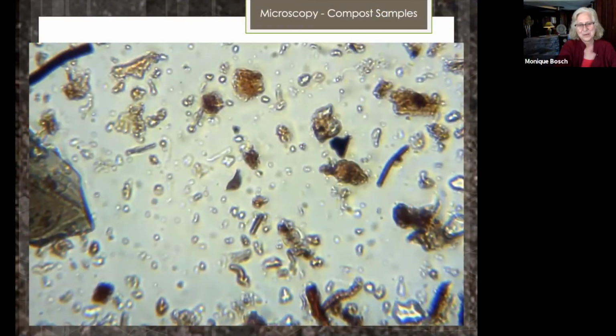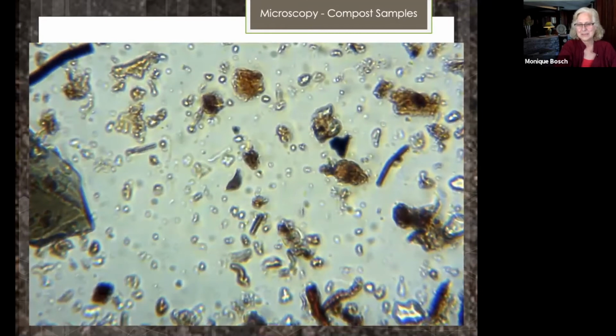What I find ironic about this is all those amazing composts and the topsoil from Coast of Maine beat out. I also looked at their potting soil, I looked at their compost. The topsoil had beautiful, as you can see, fungal properties, which I was not expecting. And all of the compost that I tested, besides the one I used for that test trial, was very much bacterial dominant.